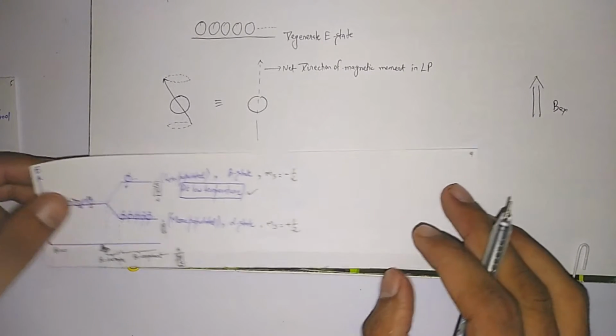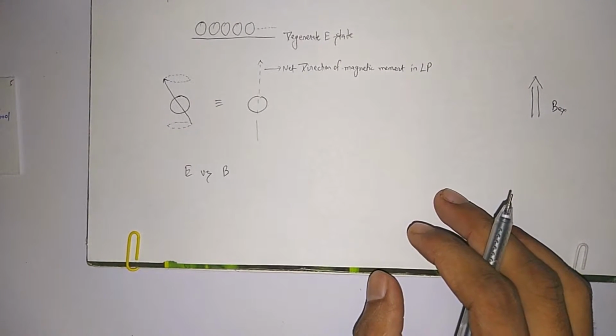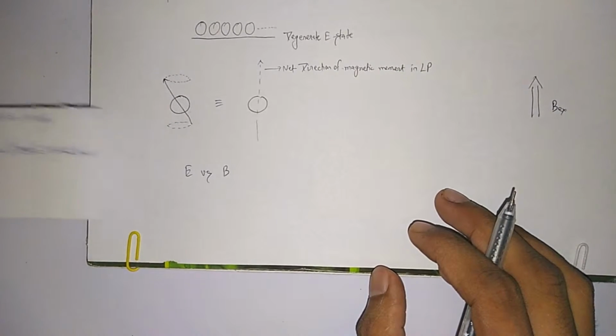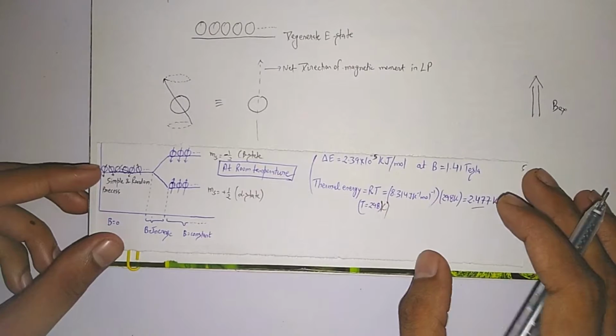But most of the time we analyze our sample at room temperature, so the previous figure is replaced by this one.